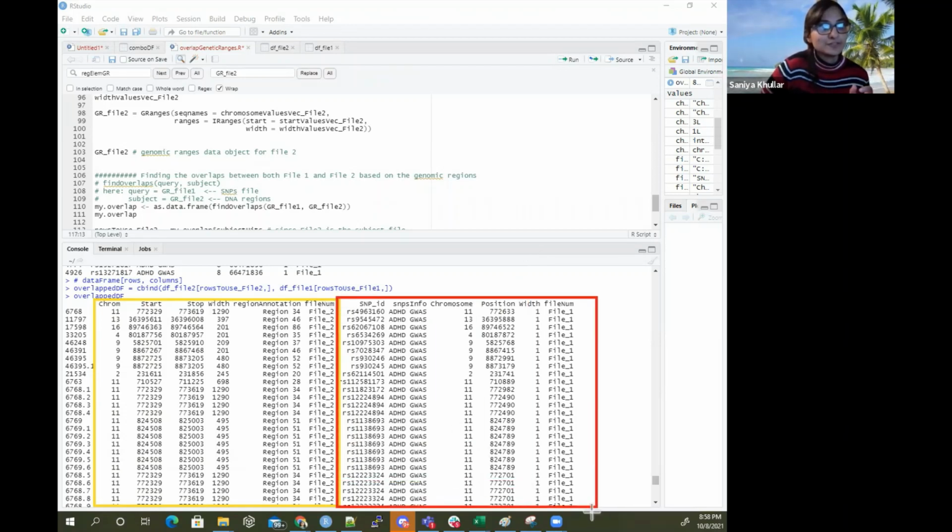Like we went over this first one, where you can see the SNP. The SNP falls within this interval. So this position here falls within this interval here. So that's great. And now let's see another one too. Let's just see what happens here.